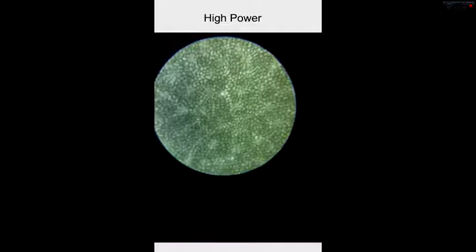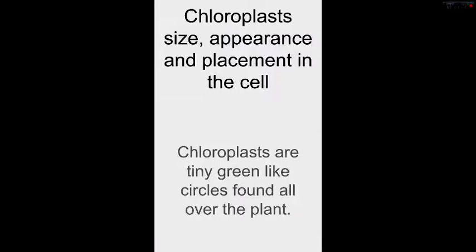Here's a picture of the leaf on high power. It's much bigger so you can actually see the cells, which is pretty cool.